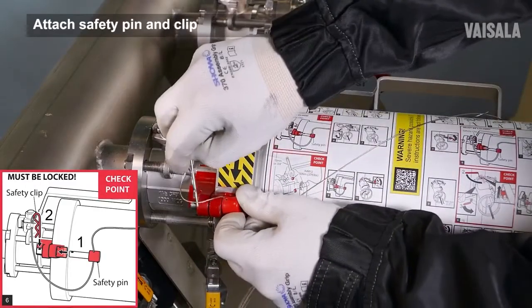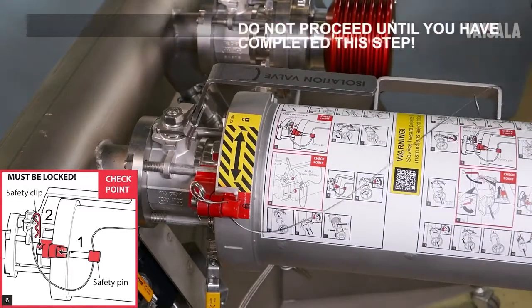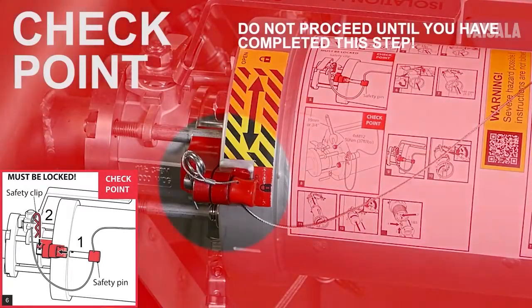Lock the safety pin with the safety clip. This is a checkpoint. Do not proceed until you have completed this step.